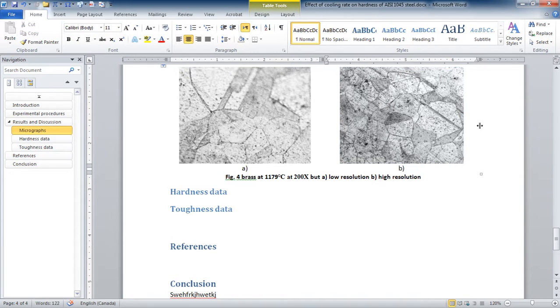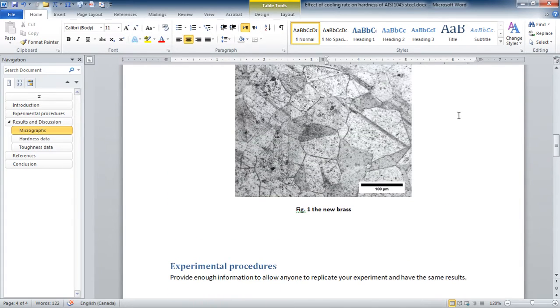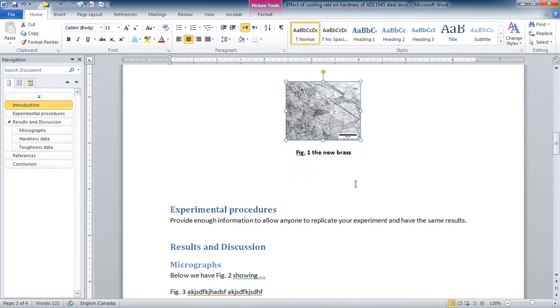The solution is putting a scale bar attached to the image, right on this image. It's an overlay, so that no matter what you do with this image, the length of that scale bar changes with the same magnification as your original image. So whatever you do, the relative size of this line to the features is not going to change.